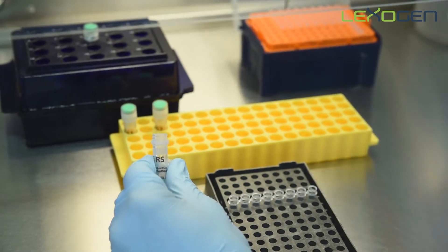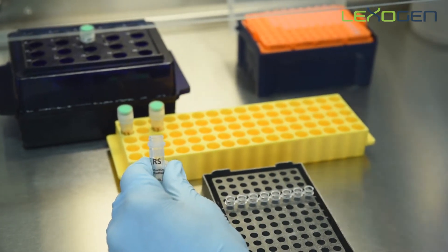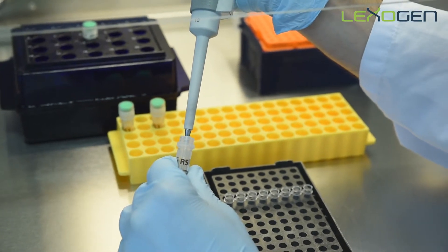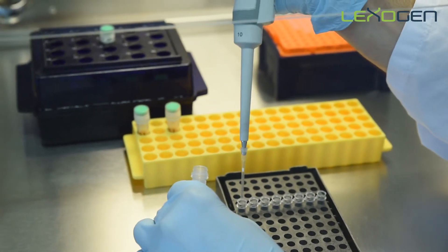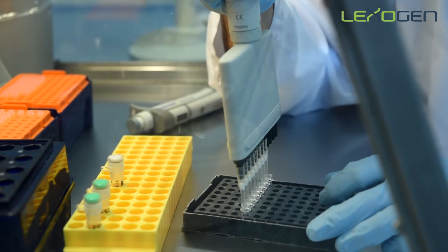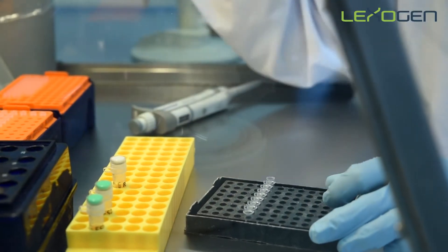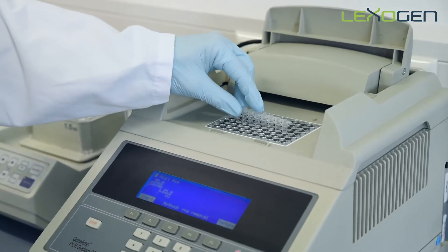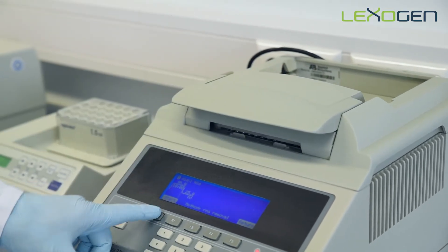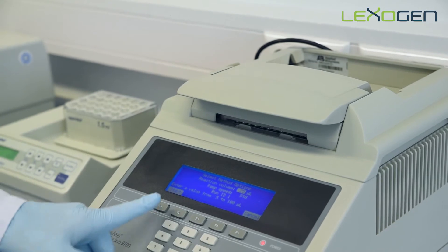Add the RNA removal solution, RS, to the samples. At this point, if you are using the globin block module, add the RS globin block solution instead of the standard RS. Mix well by pipetting. Transfer the samples to the thermocycler and incubate at 95 degrees for 10 minutes. Afterwards, proceed directly to second strand synthesis.